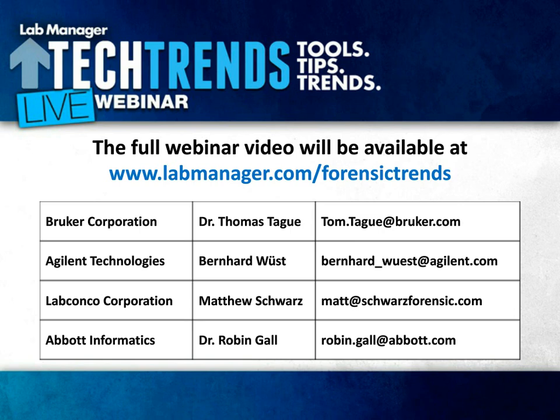Thank you. And what do you think is the best post-treatment technique for getting the best results? Right now, with the testing that I've done with these CA, dye-infused CA solutions, if you have the ability and the consistency with your chamber to make them work, I find that they're absolutely the best, because you eliminate the chemical handling, the additional applying of chemicals, water rinse, the hazardous waste involved with that, and the time and effort. Other than that, I've seen some great results with some of the new UV-IR capture systems of full spectral imaging and some white light photography.